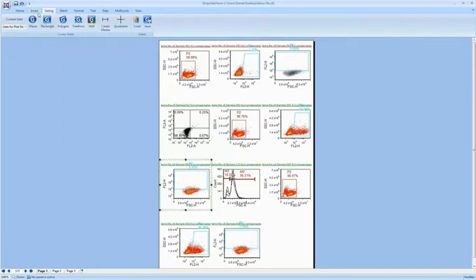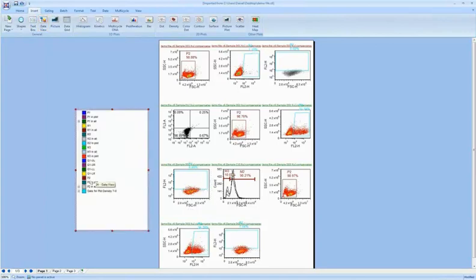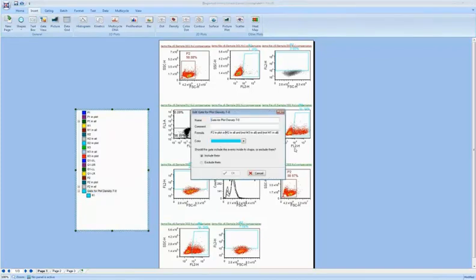Well, if I want to look at the definition, I'm going to insert what we call our gate view, which gives you a hierarchical look at what is in your gates. And the gate for plot density 7, if I double click on it, you can see that this formula consists of the gate P2 in plot, or M2 in all, and not M3 in all, and etc. So whatever you chose to do in CFlow, FCS Express recreates that gate.